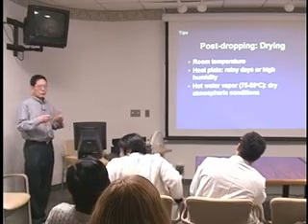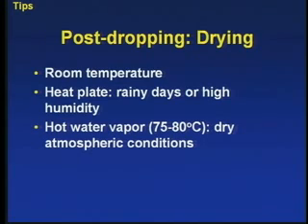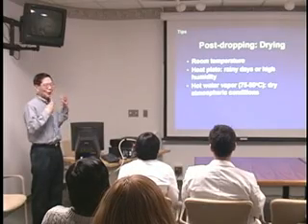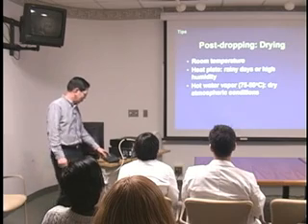After you drop, you look at the slide, and it looks good. Now what should you do to keep that good condition? Normally you let it dry at room temperature, or you can use a hot plate during rainy days or high humidity to reduce the drying time a little bit. Or when the humidity is very dry, you can use hot water vapor, which adds temperature and moisture to the surface of the slide. Now these things are very empirical, but they help to make the slide look better.